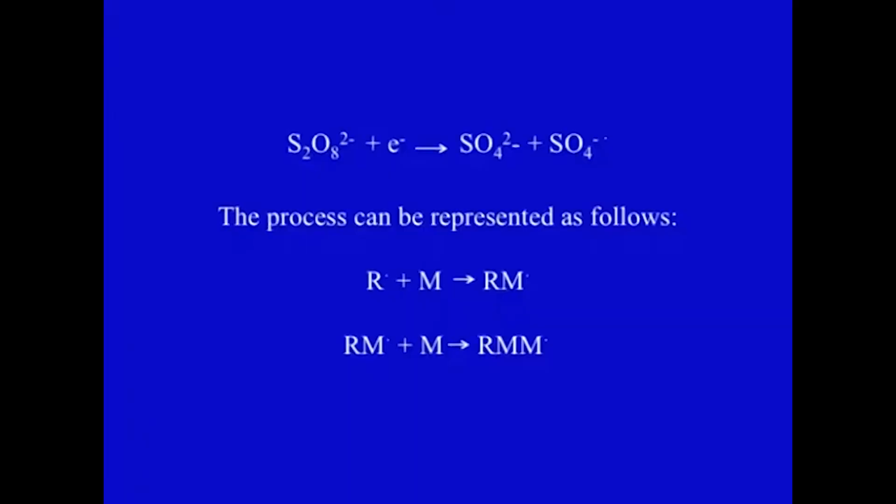If we look at the screen, you have a persulfate ion, which is decomposed into a species with a single unpaired electron. So, a free radical is generated. Now, if M is the acrylamide, representing the monomer, and R is the free radical, then it is a kind of chain reaction which leads to the formation of cross linking in head to tail manner. It goes on, and in between bisacrylamide is introduced.